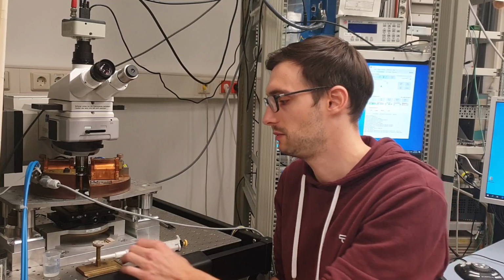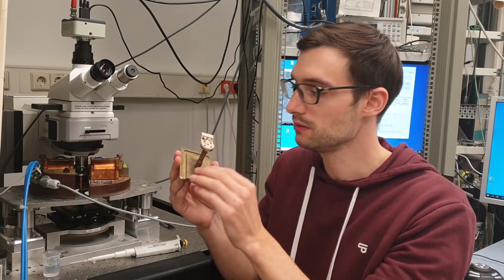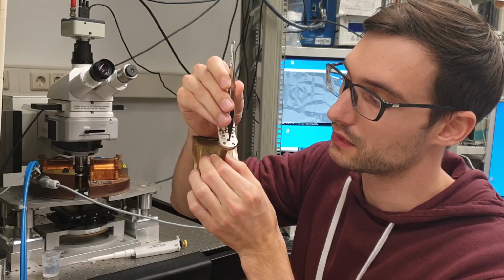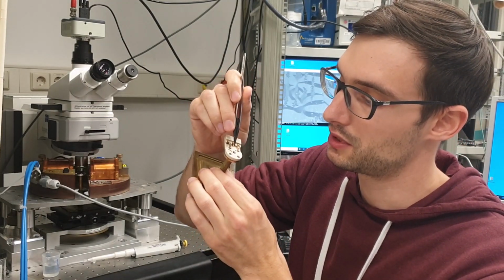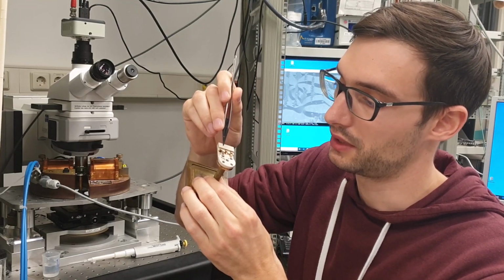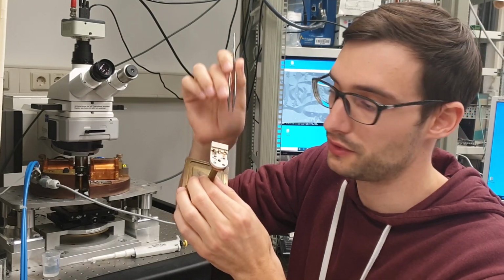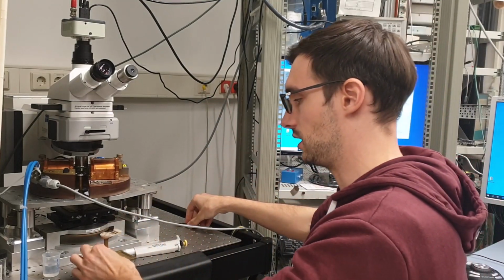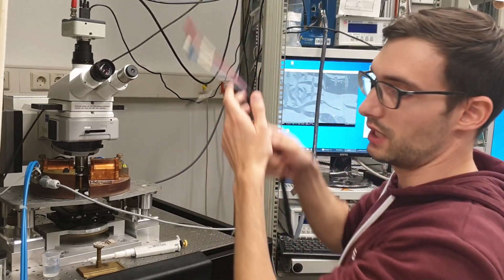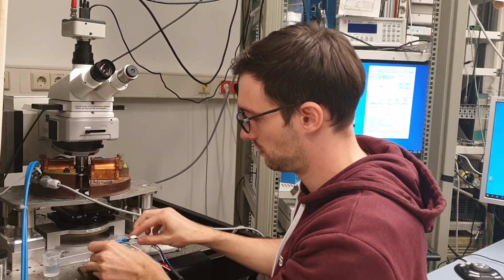So, if we want to probe the impact on the magnetic properties due to electrochemical reactions, we can use this electrochemical cell, which is already fully assembled. So you can see here the sample sitting in the middle, which is connected as a working electrode, and then we can use two other electrodes, one as a counter electrode and this one as a reference electrode, for instance. And in order to do some electrochemistry, we attach the sample to a potentiostat, which you see here.